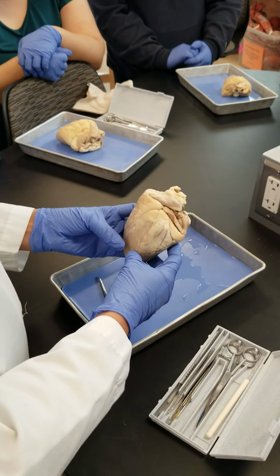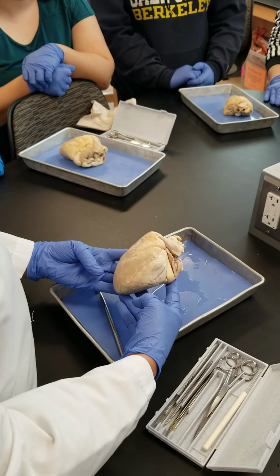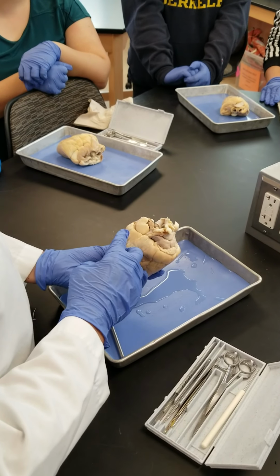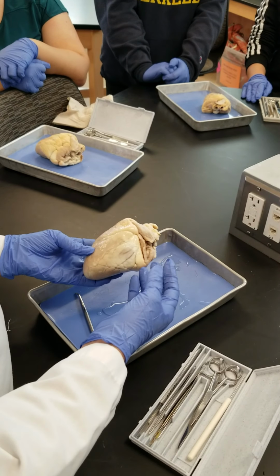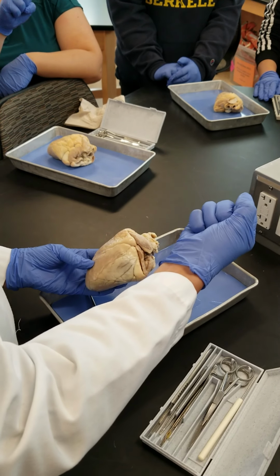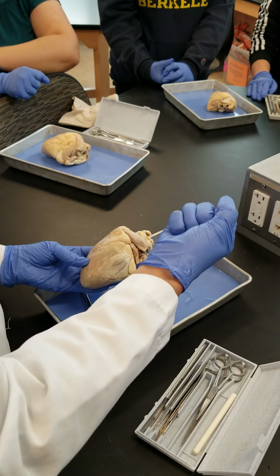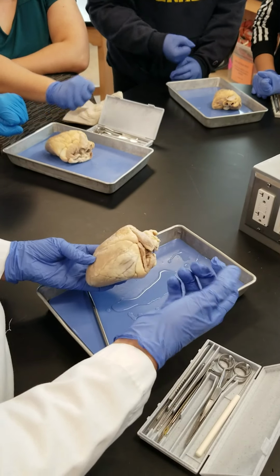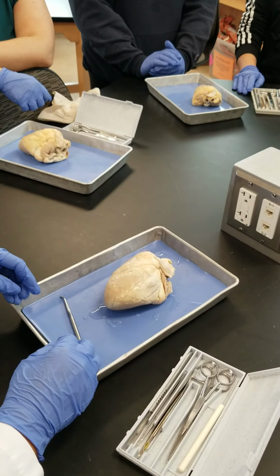So, ready? Yep. So here, this is a heart. Look at that. Isn't it beautiful? Yes. What's the size of your heart? As a fist. Closed fist, right? Everybody's closed fist. Some is smaller, some larger. That's the same for your body too, right? So that's not a big deal. It's doing the job for that body, right?